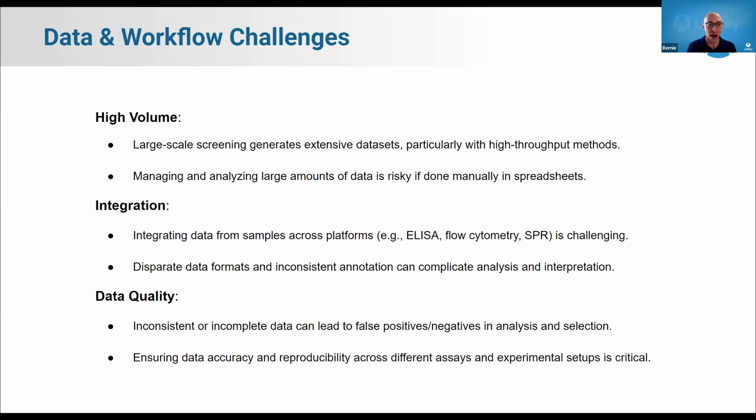And leads to organizational issues with different people having different files containing repeated information or missed information. Not great. Integration, integrating data from all the different samples you're dealing with in different locations and different plates, across platforms like ELISA, flow, and surface plasmon resonance, that can be challenging. And you can end up with different data formats, inconsistent annotations, and when you find yourself in a situation like that, analysis and proper interpretation can be harder.